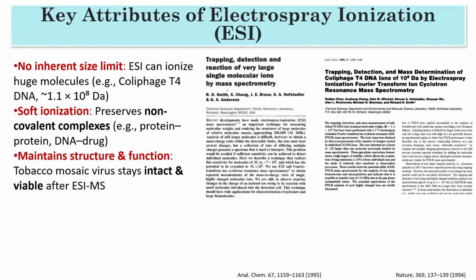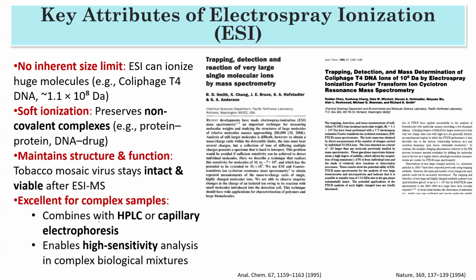So yeah, you can see if you use this ESI method, it can also maintain structure and function. So you can understand how important this method is. If you combine this with HPLC or capillary electrophoresis, even for a complex biological mixture, you can get mass analysis.